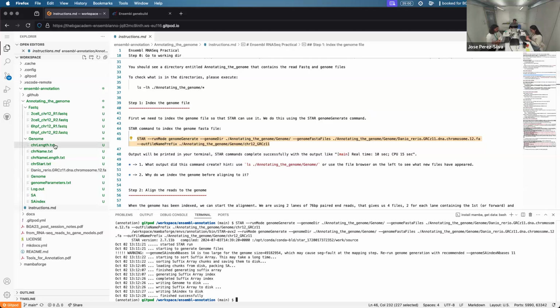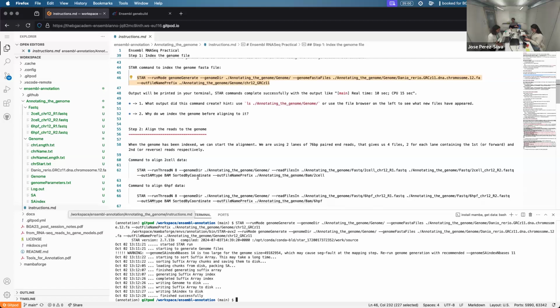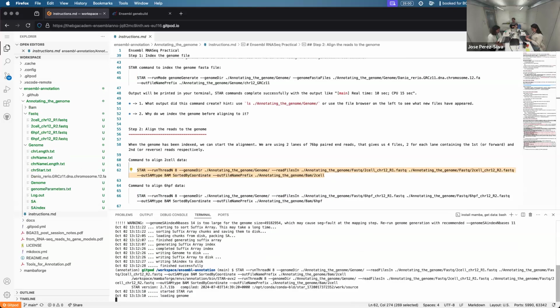So yeah, we have several text files, several log files, and index files, all of those recently created, that's the green color. And those are essentially a guide that the same program STAR will use when we tackle the next step, which essentially involves the actual mapping. Now, let's start the next step because it may take a while and I will talk to you in between.